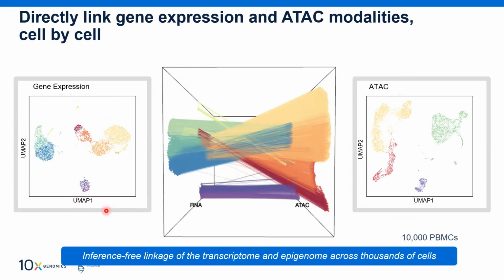And why it is important: from this group, which is a B cell population, naive and memory B cells have the same expression pattern, clustering together in this window, whereas they are split in the ATAC data into two sample types, memory and naive, because the chromatin patterns are different. So ultimately, it is giving more power to resolve the data at different resolution.